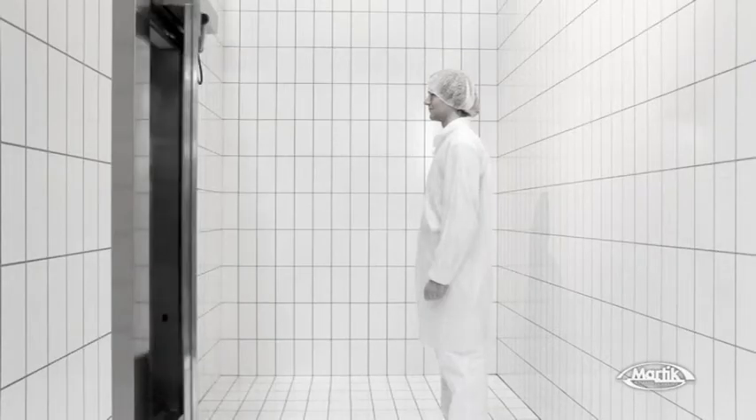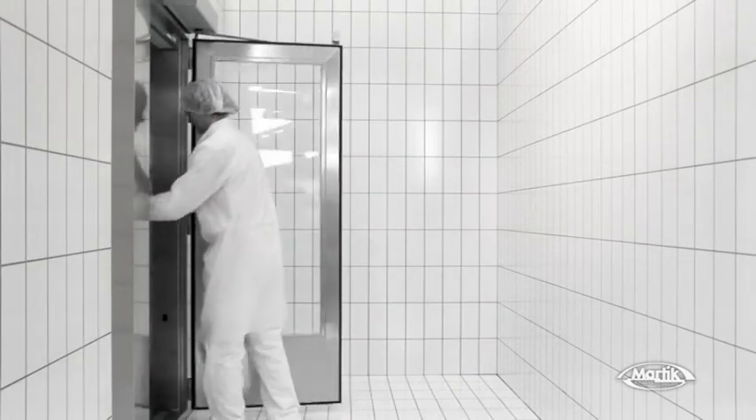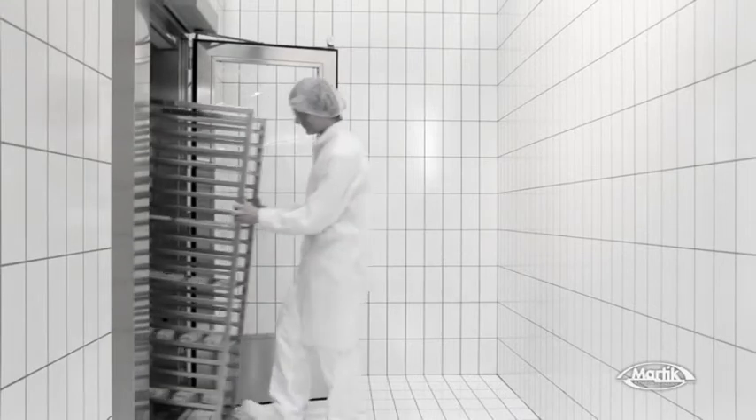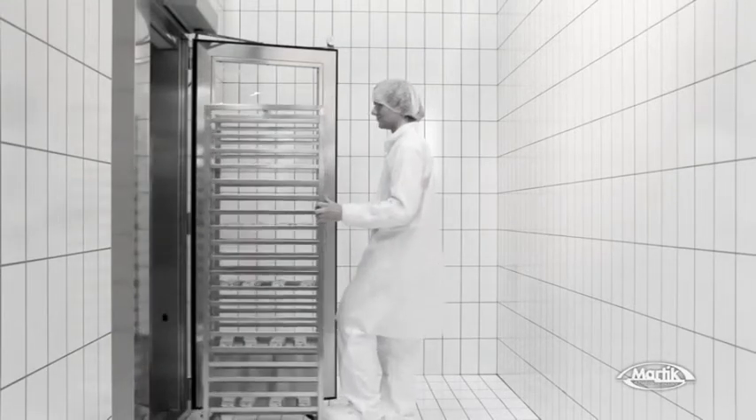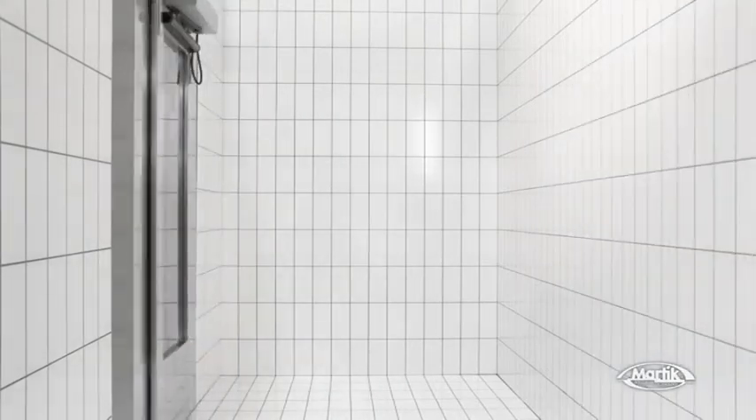The external warning light is red during sanitizing. Once the sanitizing step is over, it turns green and the door is released. Now you can take your trolley out perfectly decontaminated. When the door closes again, Airtek self-cleaning starts.